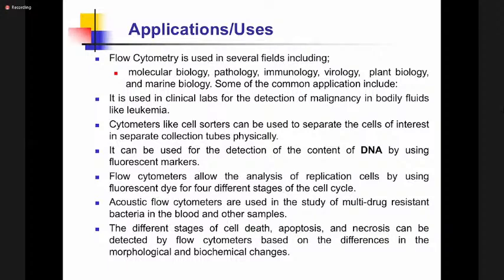And to do that, I mentioned to you, you must rupture these cells a little without breaking them overtly, in what is called rocking, just shaking on the rocker. And with that, it will cause a rupture on the surface of the cell to expose the chromosome.